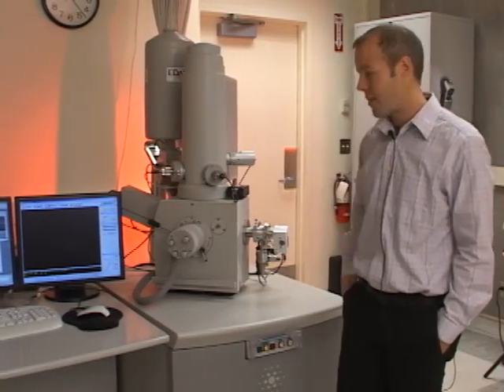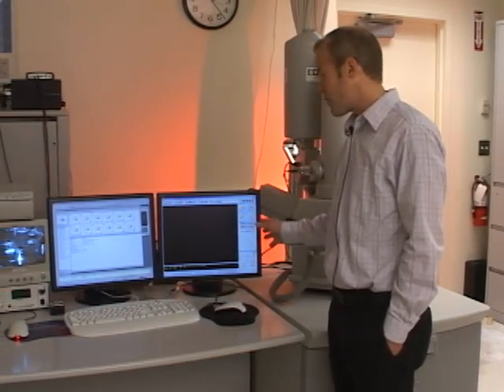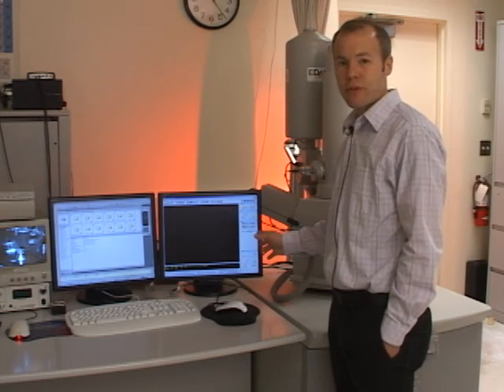To operate the microscope, there are two pieces of software, both run from the same CPU, open on two different monitors. On the right-hand monitor is a program called Microscope Control, used for all adjustments on the microscope. On the left-hand monitor is a database called Scandium, which we use to store images before exporting them.